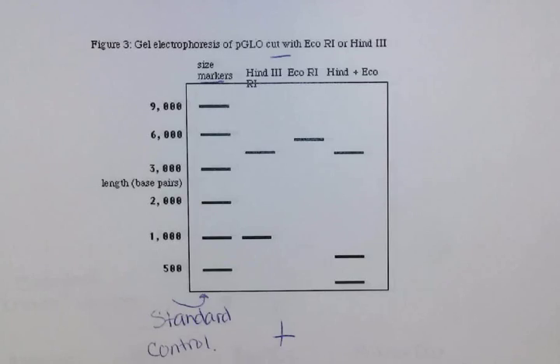So today we're going to talk about what to do with our DNA fingerprints once they have been run. One of the things that you can do is take a look at the banding patterns that exist. So this is a sample DNA profile that has been run, and as these fragments of DNA separate based on size, we can see that they end up with these lines that fall into different locations, and these are referred to as banding patterns. Okay, we can see that this line and this line ran the same distance, so we would assume that they are the same size of fragments.